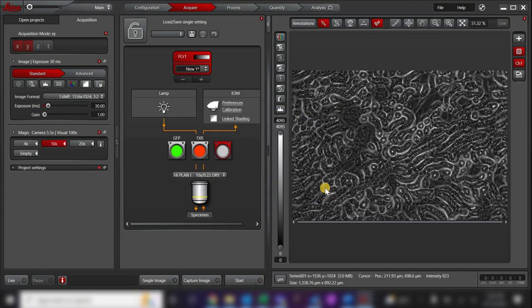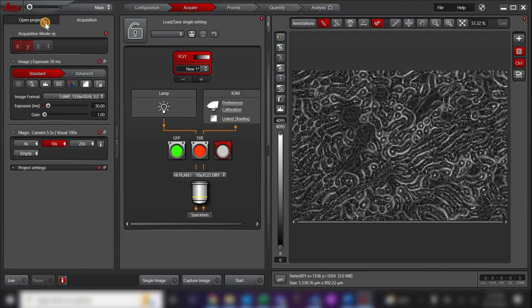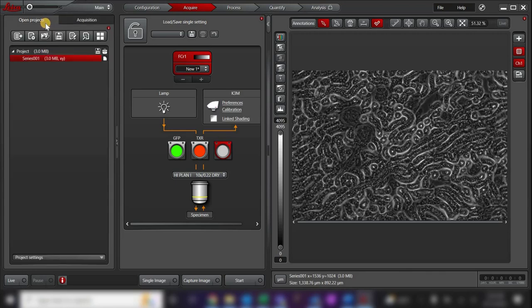Once the image is taken, you can navigate to the Open Projects tab to view your image. Here, you can choose to rename your image by right-clicking on the image and selecting Rename.